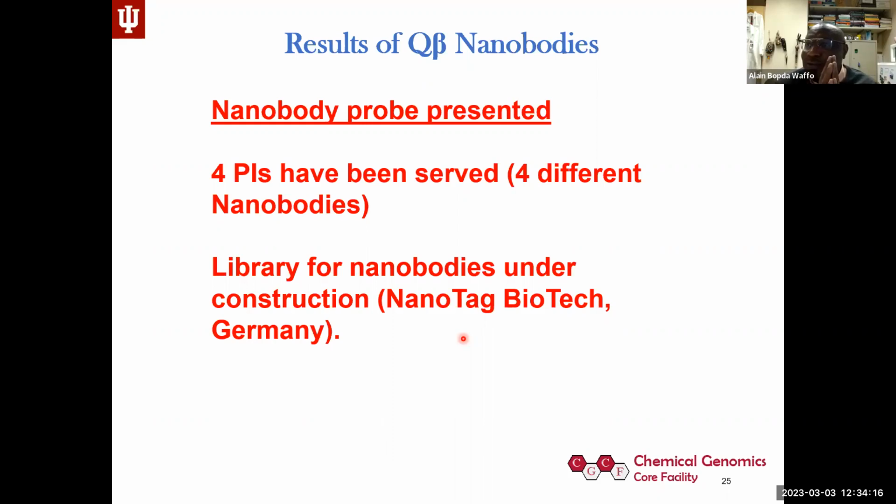I'm going back to what we just had, being an investigator of COVID. The major motif binding the receptor, which is the ACE2, is just 17 amino acids long. So we are trying to know what is really the key one. If you split them into four amino acids that make contact with the receptor, we really want to go to the question and answer: what is the key amino acid?